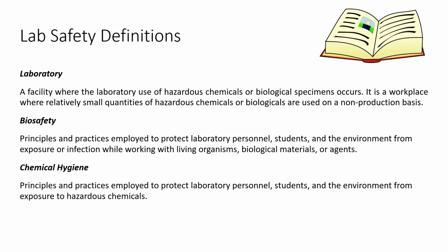Biosafety: the principles and practices employed to protect laboratory personnel, students, and the environment from exposure or infection while working with living organisms, biological materials, or agents. Chemical hygiene: the principles and practices employed to protect laboratory personnel, students, and the environment from exposure to hazardous chemicals. In the clinical chemistry area in the hospital, laboratory, or clinic, biosafety and chemical hygiene are both practiced. Most of the patient specimens that are received are biohazardous materials, they're blood. And then we talk about bloodborne pathogens as we go through more of this PowerPoint here.